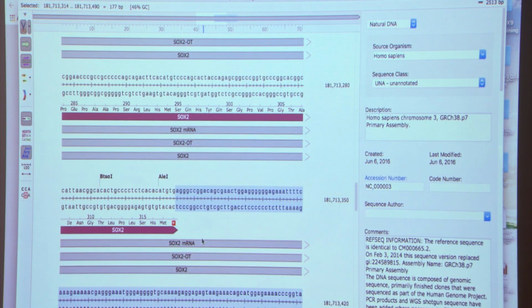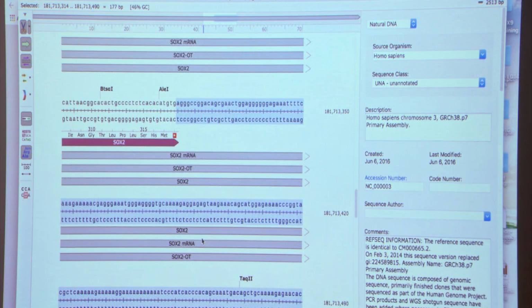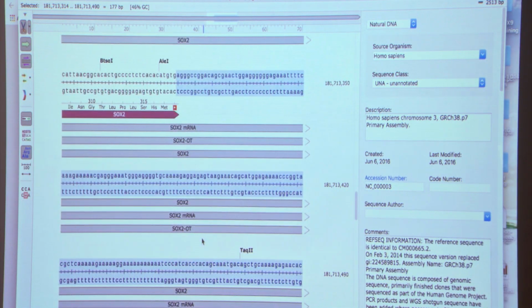Excuse me, Kate. Yeah. This is a SnapGene Viewer? Yes, SnapGene Viewer. That's as far as I got. Yeah, so there's SnapGene, which you have to pay for, but then SnapGene Viewer is free. So it's pretty convenient for this. If you do a lot of cloning, SnapGene is really useful, but it's definitely easy to use SnapGene Viewer for this.